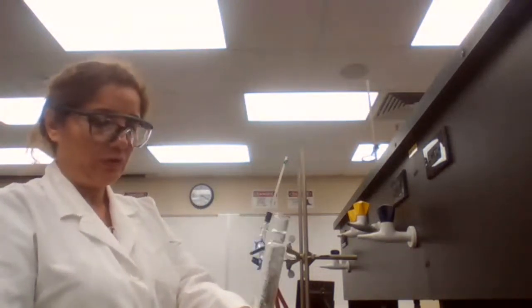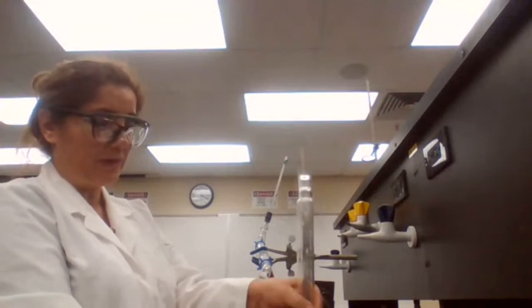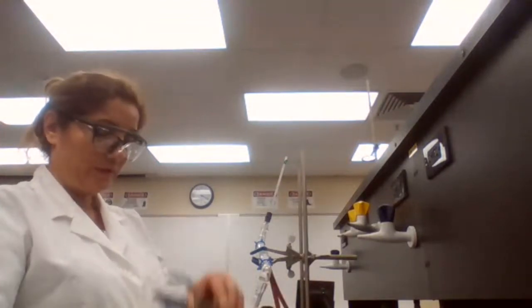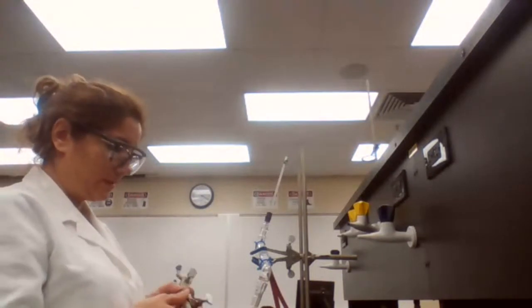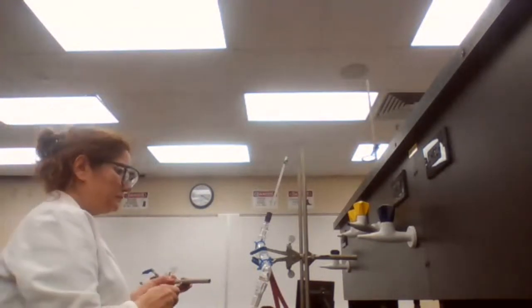Assemble it. To hold the condensers, we are using a three-finger clamp. Sorry, not the ring, the three-finger clamp.